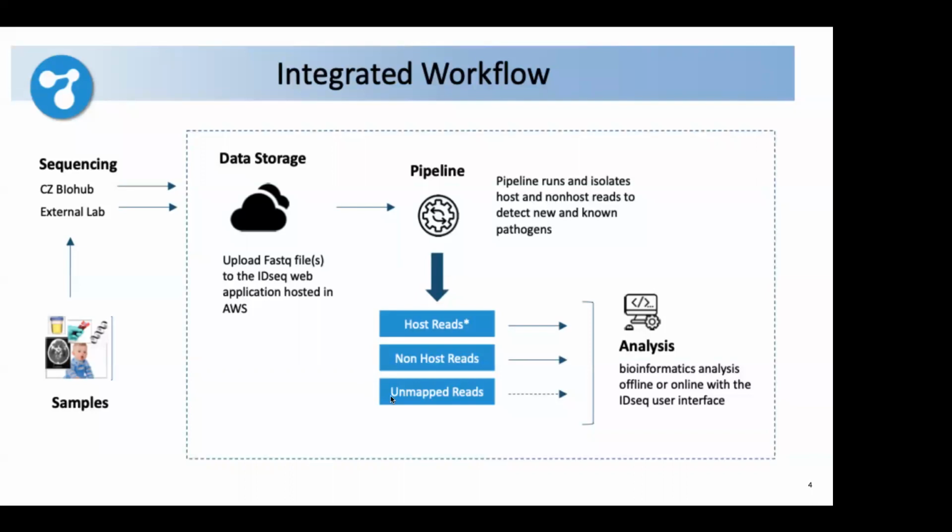So as I said, this is this categorization that we're doing. And for IDseq, we are really interested in those non-host reads. So we actually will throw away those host reads to surface what are the potential infecting agents there, or what is the landscape of microbes within this sample.